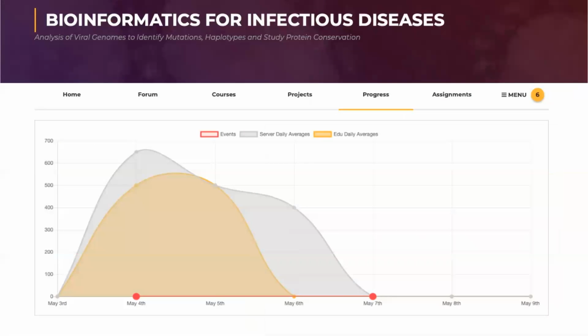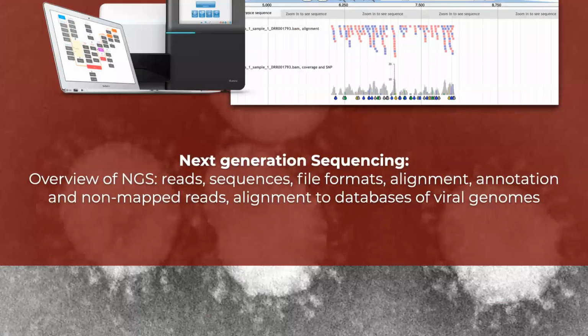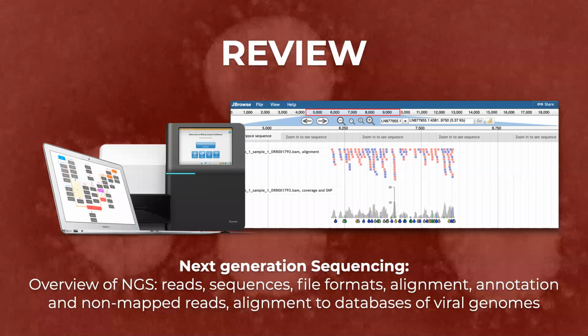And so now let's review what we did in our last session. So I saw some of you try to replicate some of the pipelines that we did, and maybe had some challenges. And so let's just make sure that all of that is clear.